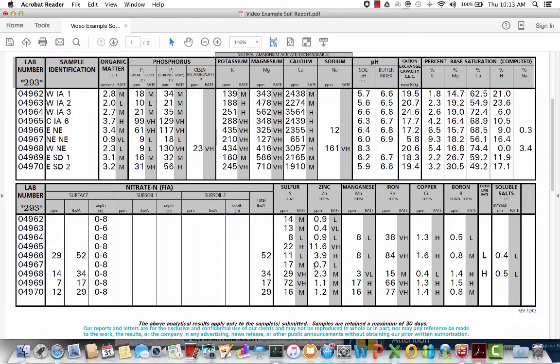So here on the 6th sample down, this is going to be that northeast Nebraska sample. We knew it was a very light, sandy soil, low CEC, fairly low fertility with the exception of potassium, low organic matter, and we're low on zinc here as well. So I'd certainly be making a zinc recommendation in that one. And that goes back to sandy soils versus heavier soils.